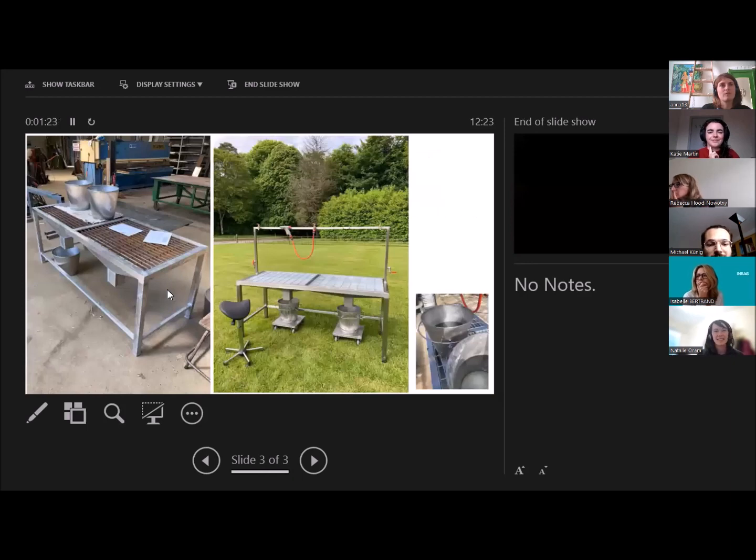So this is our table, and if you are interested in building a root washing table, I've done this a couple of times now, and I'm very happy to share any experience I have or drawings. But maybe this could be more of a discussion thing. This is our gorgeous table, and it makes it actually quite easy to wash roots and much more enjoyable than sitting over a bucket. So that's actually all for me. If you have any questions or anything, I'm happy to take them.